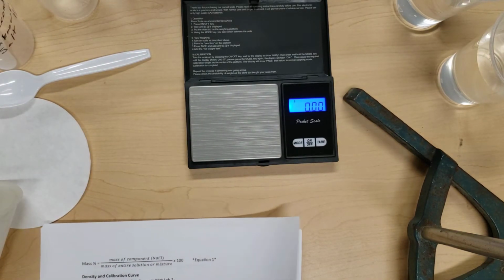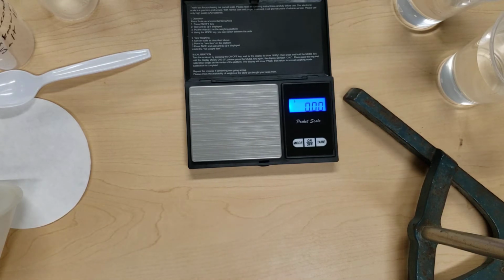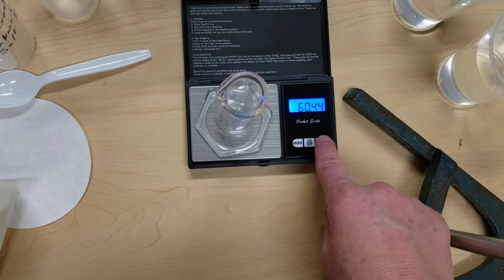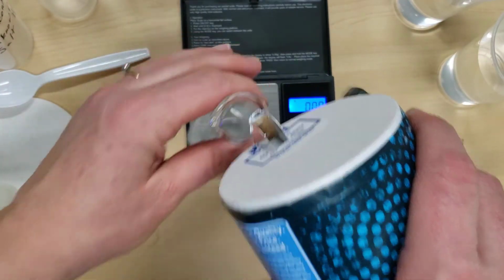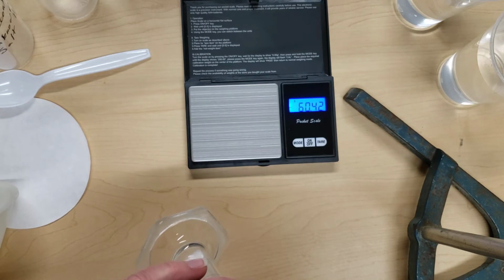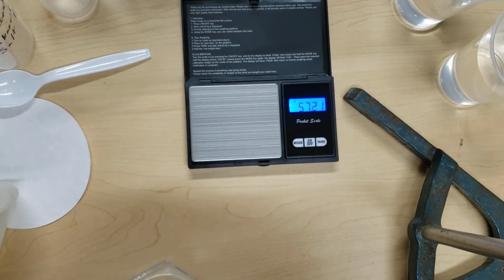So for this lab, you are going to have to make your own unknown solution. In order to do that, we want to take a 25 milliliter graduated cylinder. We're going to tare the cylinder and add about 10 grams of salt. So we're going to add about 10 grams to our graduated cylinder and weigh it again.